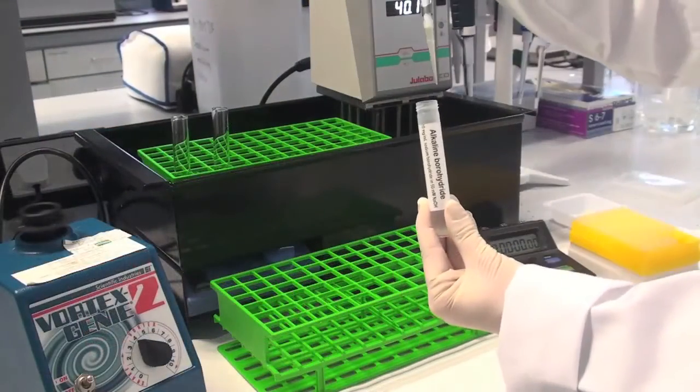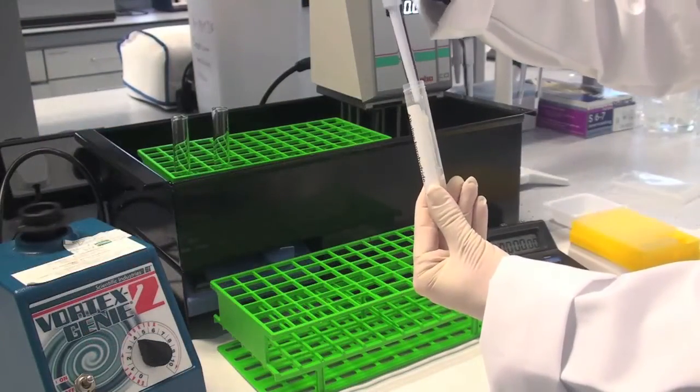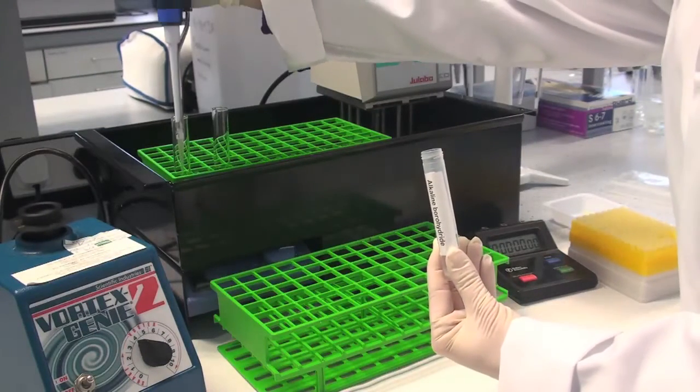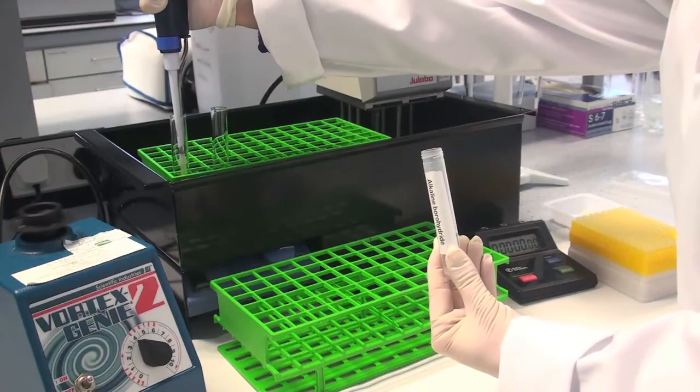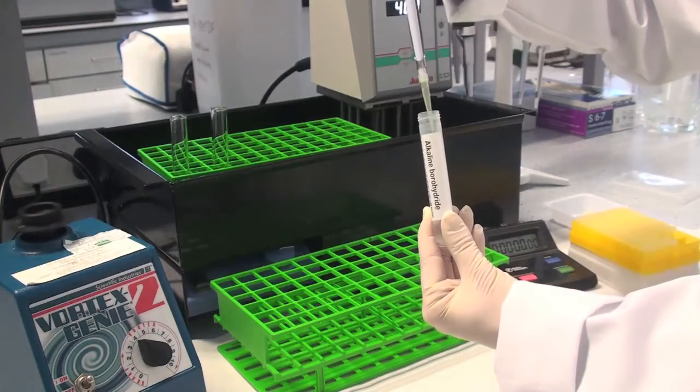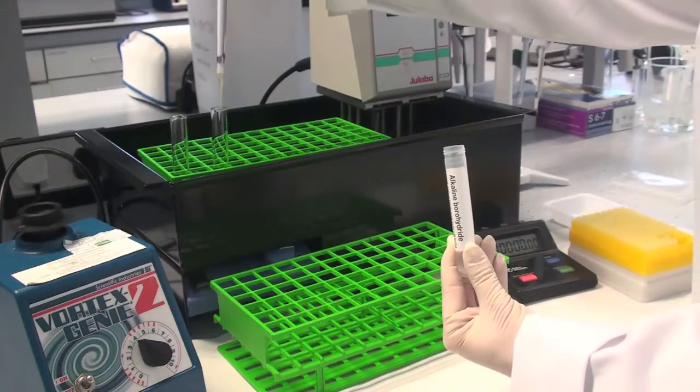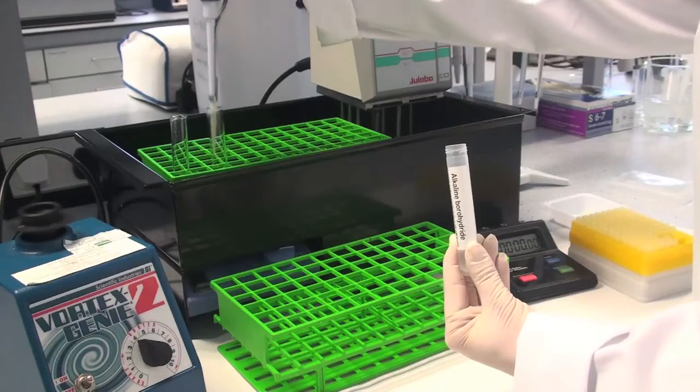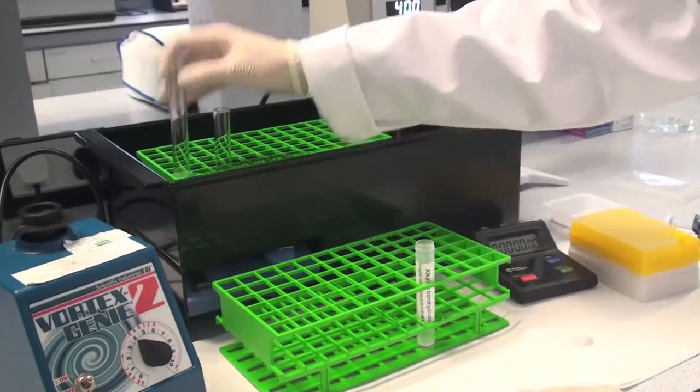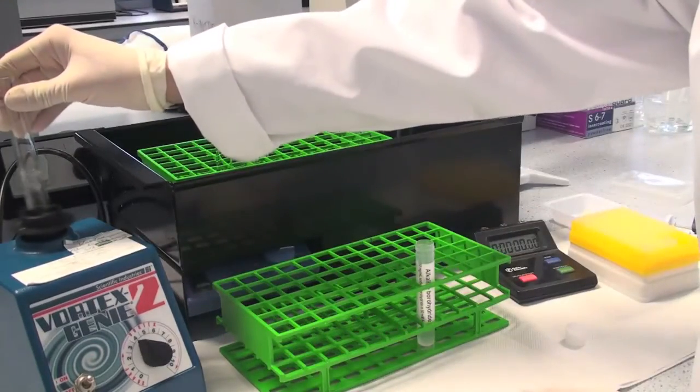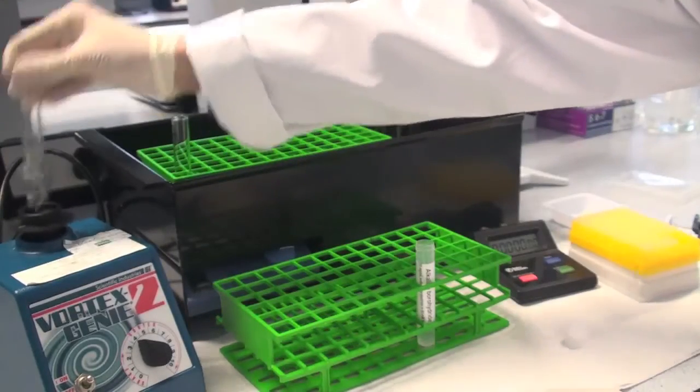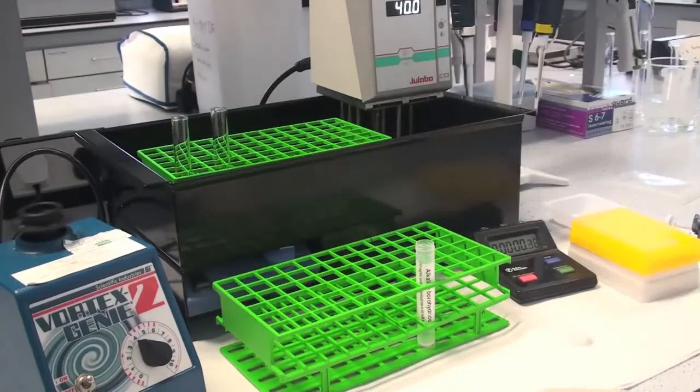Add 0.2 ml of reagent 3 alkaline borohydride solution to the tube. Stir the tubes vigorously on a vortex mixer and incubate them at 40 degrees centigrade for 30 minutes. This will affect the complete reduction of reducing sugars to sugar alcohols.